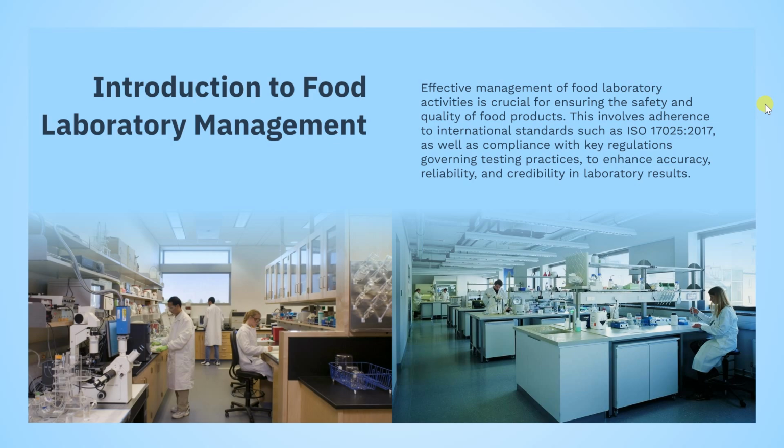And of course, we discussed accuracy and precision and how we can maximize our efforts to minimize errors, whether random or non-random. Therefore, this standard is very important for people in food laboratories in order to give accurate and reliable results to our clients, or for our raw or finished products, before we send the products to the market.